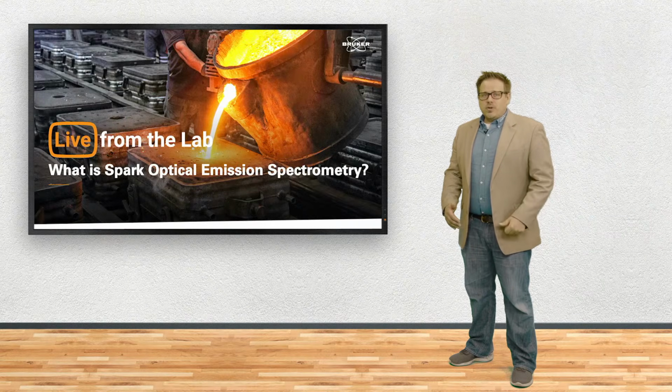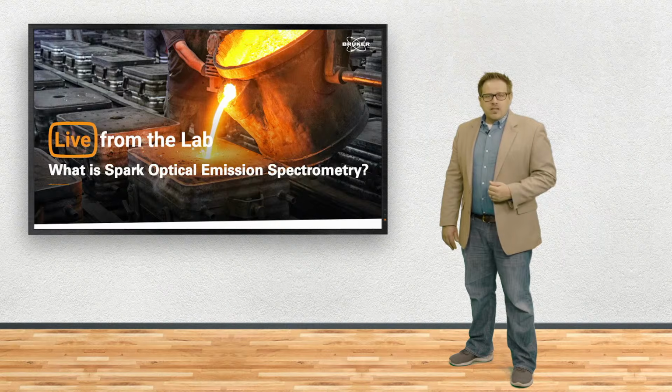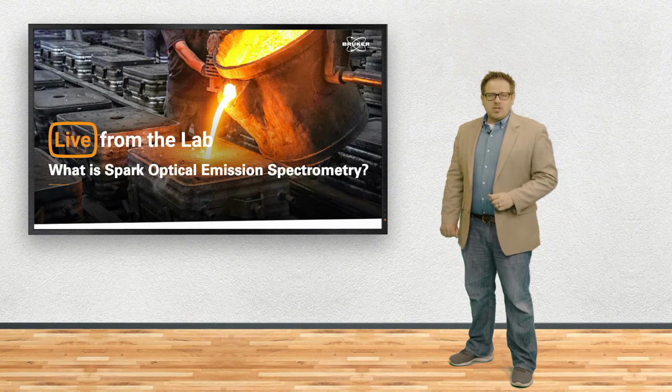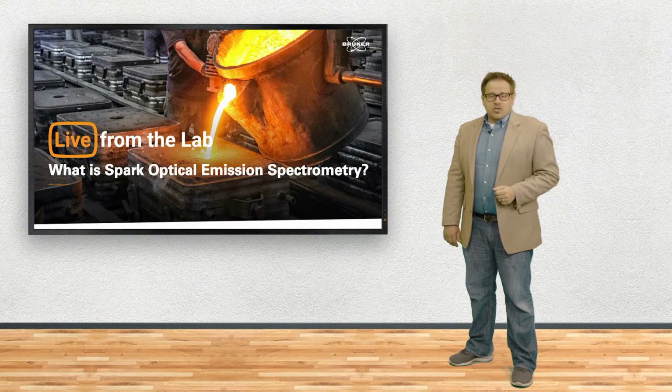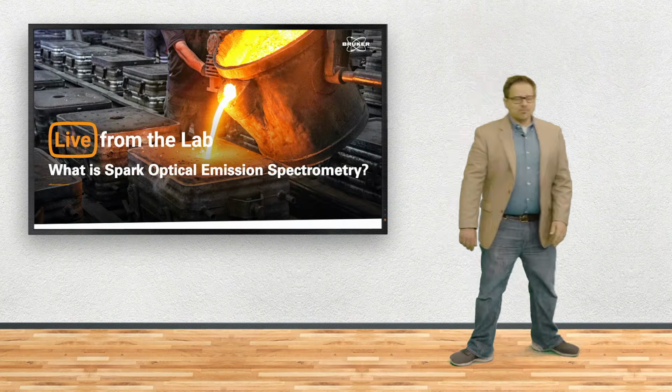Now, to dive a little bit more in depth, we're going to talk today to some of our colleagues over in Karlsruhe, Germany. We're going to see a demonstration. And if you have any questions, make sure to type them into the chat box, and we will get to those at the end after the lab segment. So with that, let's go on and talk to one of my colleagues to get a little bit more in-depth info on this technique.